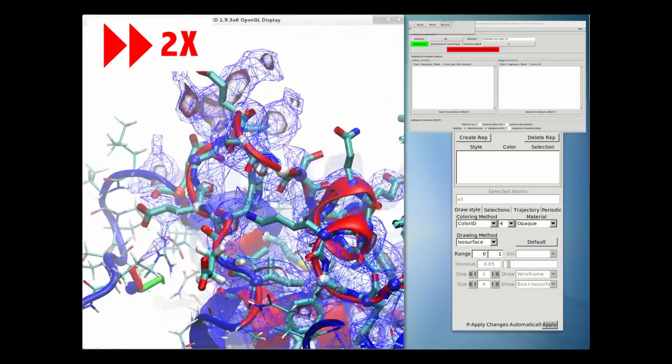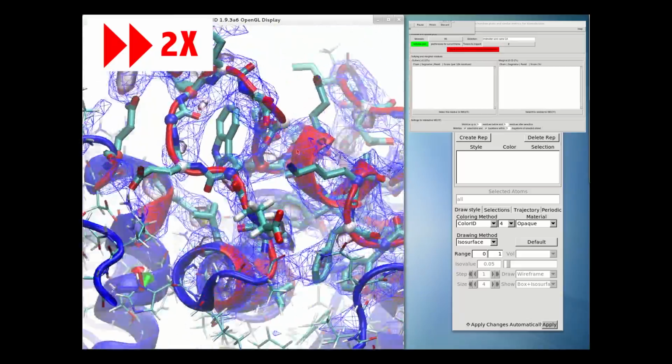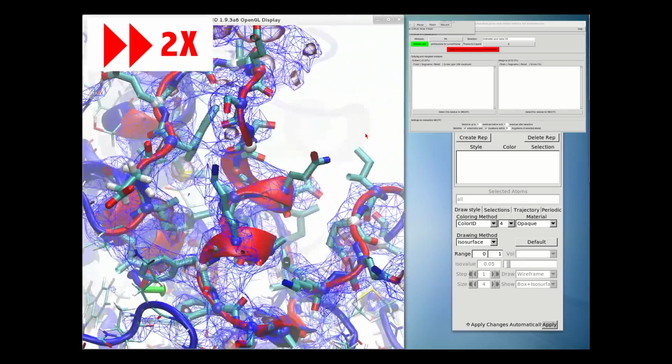This seems as good a time as any to stop and run a reciprocal space refinement to generate a new set of maps. I'm going to do this in a few steps. The first thing I'll do is run a b-factor only refinement with coordinates fixed to provide a model with individual b-factors from which I can derive a set of TLS groups.